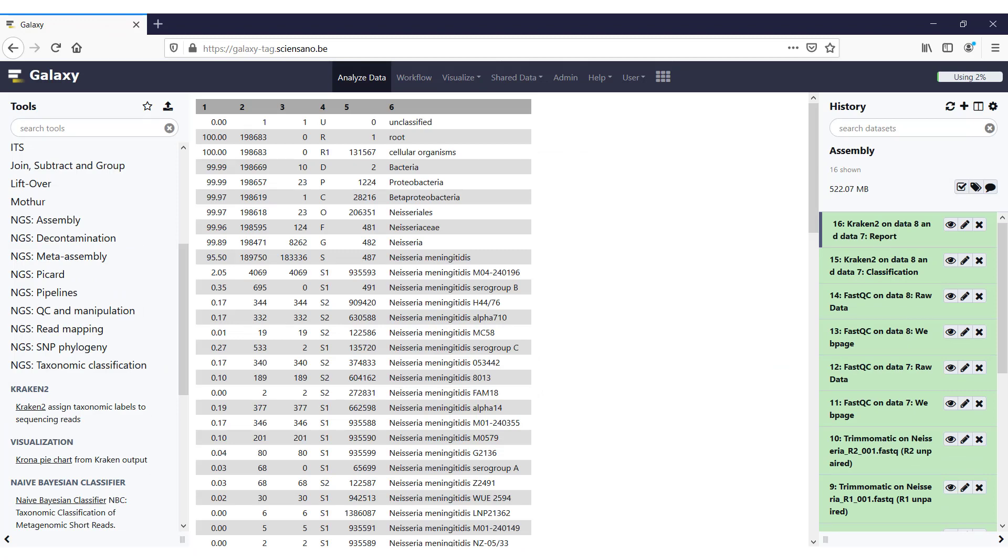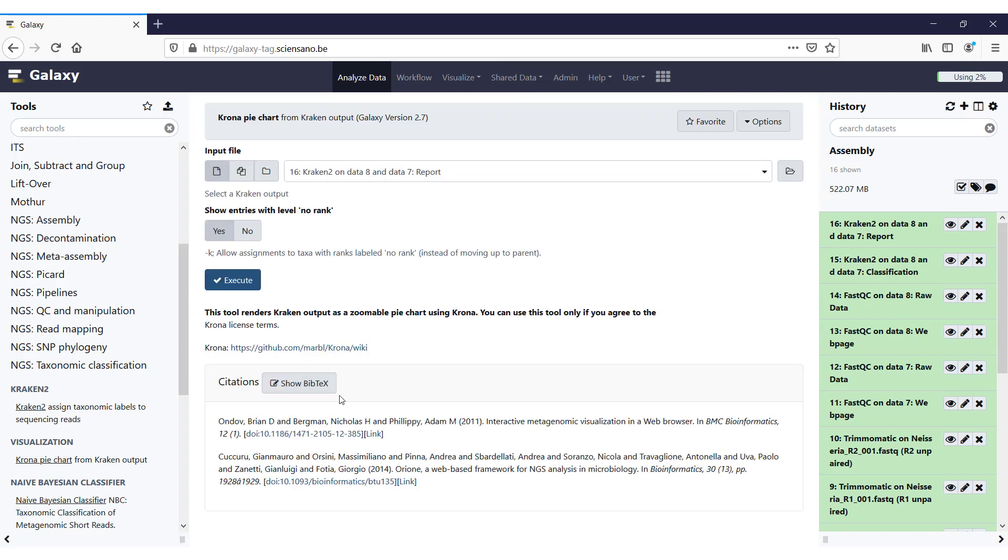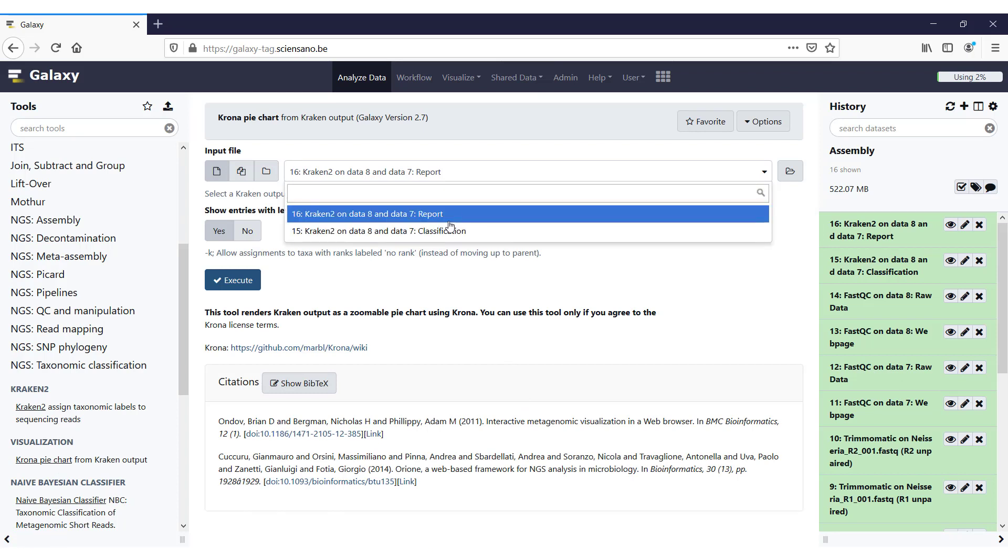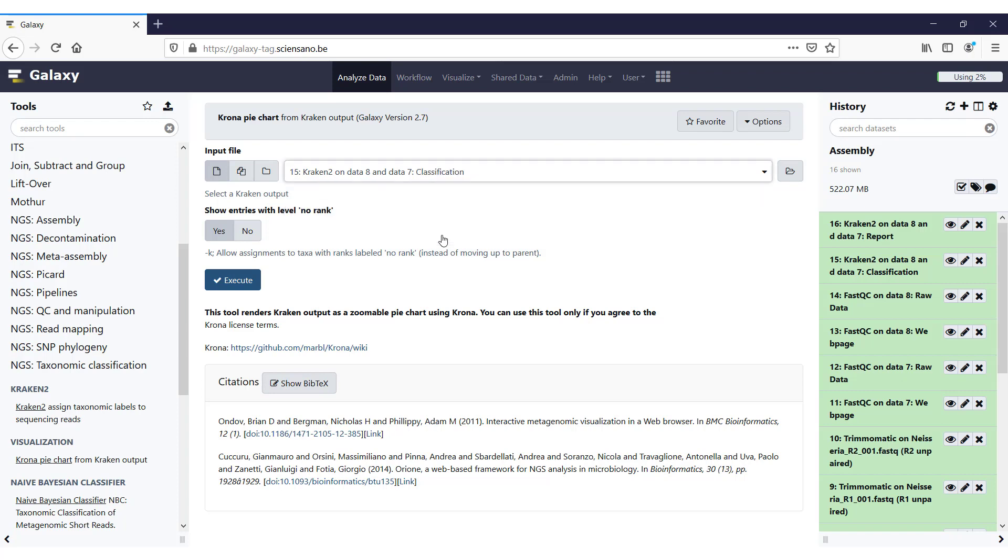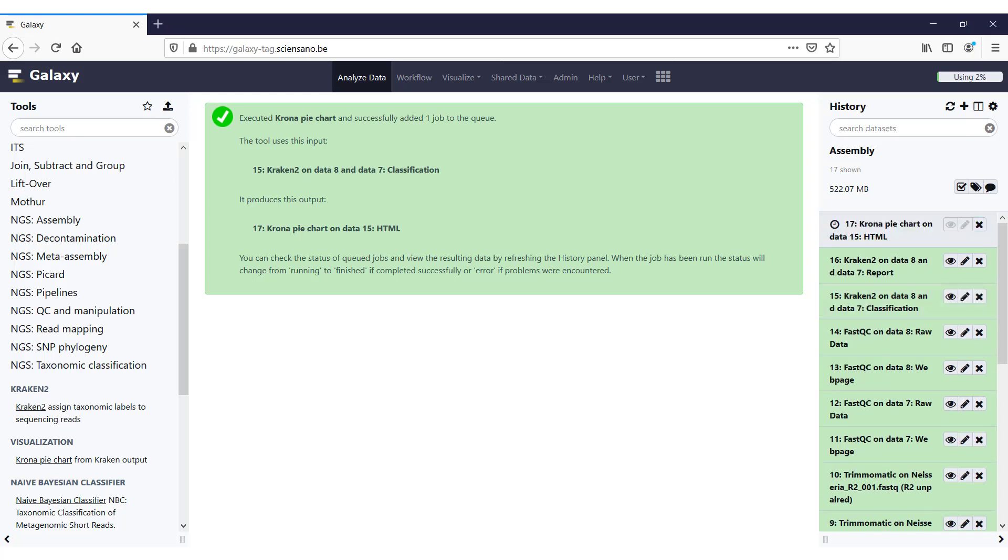You can also make a visual representation of these results, and you can do that with Krona. So you can find the Krona tool in NGS taxonomic classification, under the visualization label, and there you will see Krona pie chart from Kraken output. So if we just open it, the only thing that you need to do is give it the Kraken output. Always make sure that you use the classification output, and not the report, because it will generate an output, but it will be completely wrong. So make sure that you have the classification. Then the only thing that you have to do is execute, and a Krona pie chart will be created.